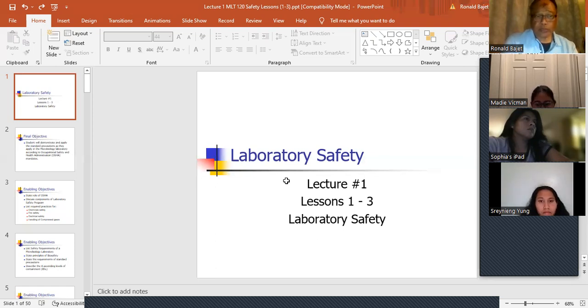So all you have to do is pull it out and put it into either the section of facultative GNR, or right next to the listed organism, like for example, Proteus vulgaris, Proteus mirabilis. These two are... tell me a physical characteristic about Proteus. Anybody know anything about Proteus?